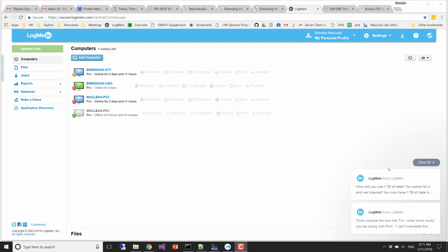So Skyline allows you to build a spectral library, and then, as you've seen, you can choose different settings. You can say, oh, I want 6 transitions, or I want to allow neutral losses, or I don't want to allow neutral losses. So like the Bruderer assay library, the big tabular file that we imported, they chose to allow neutral losses. If I now want to say, no, I don't want to use neutral losses, I've got to go back to their original search results. It's not like I can just tweak some parameters and all of a sudden. So that's what happens in Skyline.